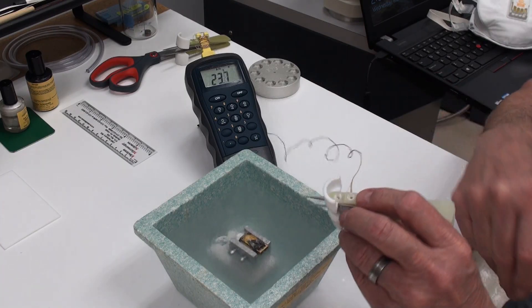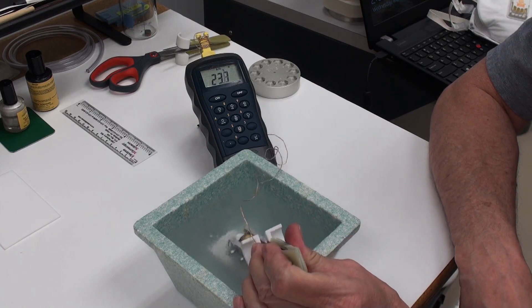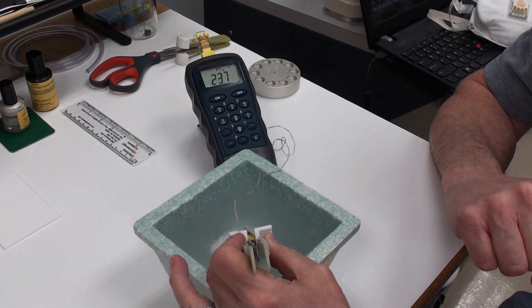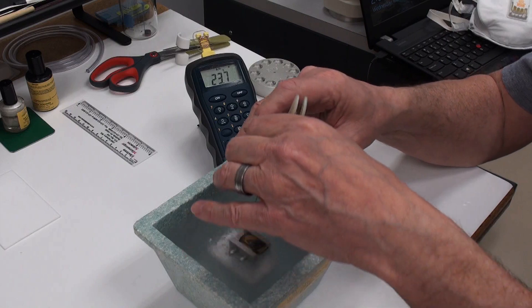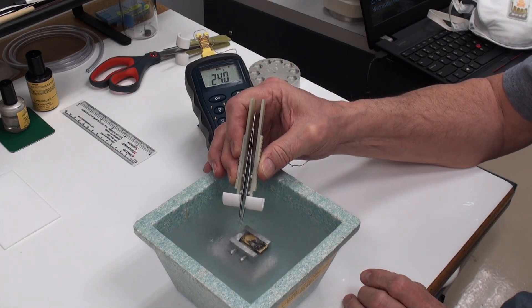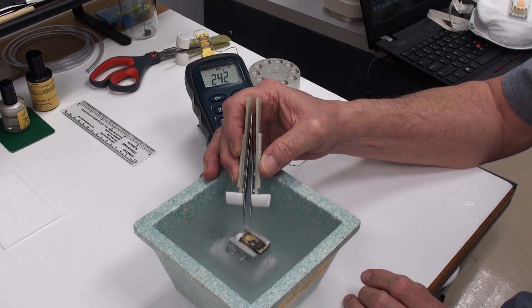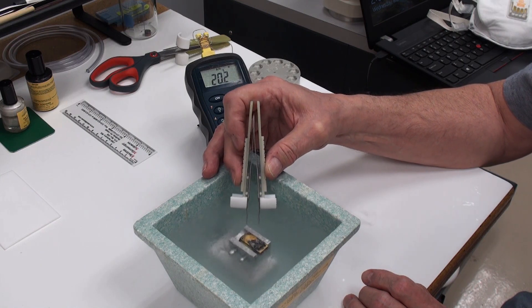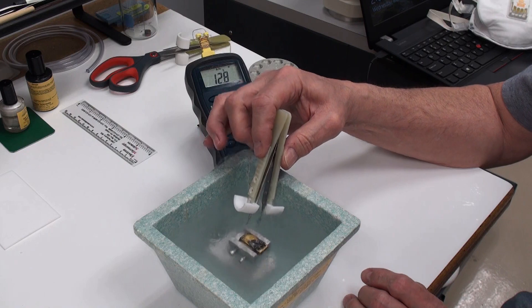They will allow you to work for extended periods in a liquid nitrogen environment without freezing your fingers. They come in a number five tip. You can work right down in the liquid nitrogen and the way it's designed it will keep your fingers insulated.